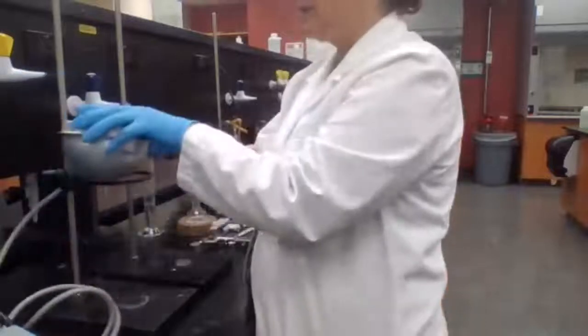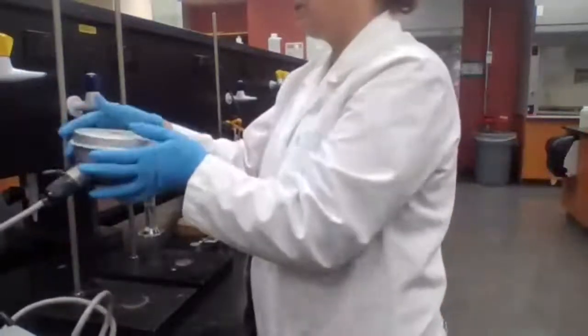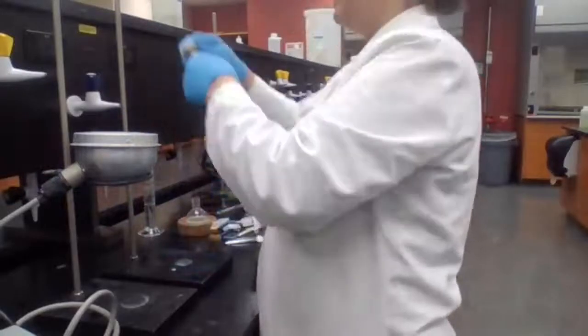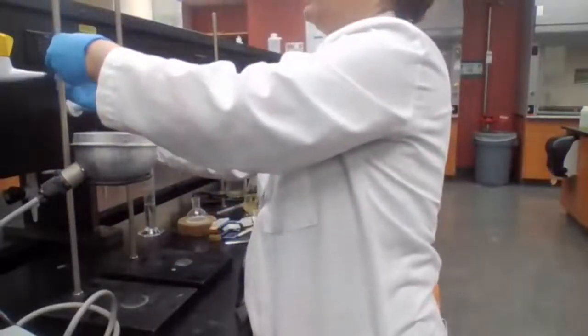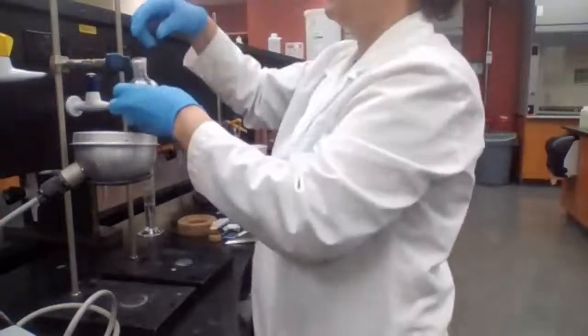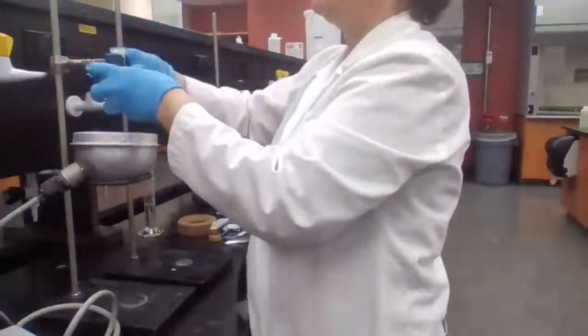To support the heating mantle, I'm using the utility clamp to support the boiling flask.